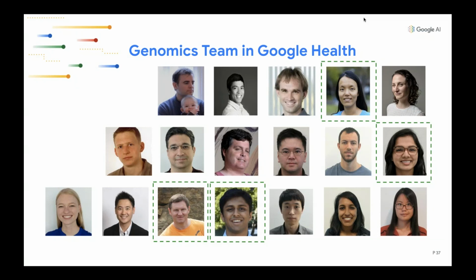Okay, thank you. And just jumping back to Andrew now, because I know he does have a hard stop at 10 a.m. So was there any specific reason to choose chromosome 20 for DeepVariant training? Yeah, that's a good question. So actually, to be clear, chromosome 20 is withheld from training. So it's used as the independent evaluation set.